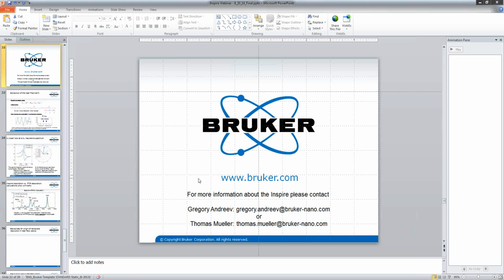One could use either tapping mode feedback or PeakForce tapping for feedback. And in contact mode, this technique actually doesn't currently work. So you would need some way to modulate the tip sample separation. One could perform contact mode first and then switch to tapping mode if contact mode is preferred for the AFM imaging.